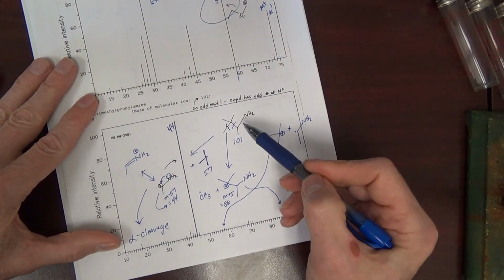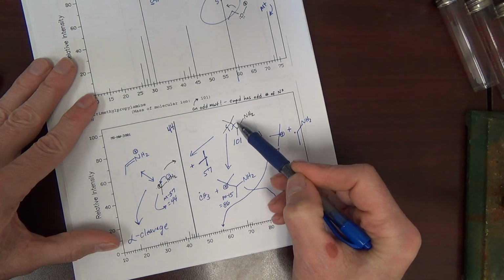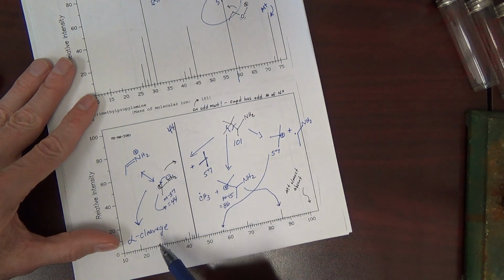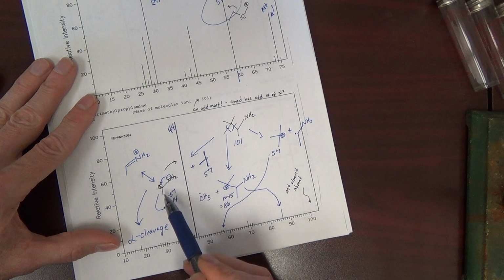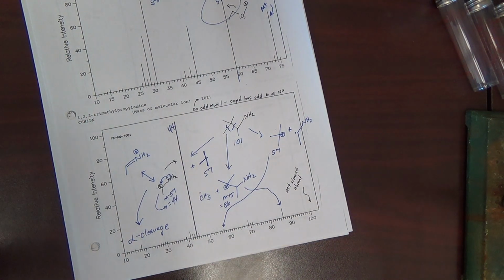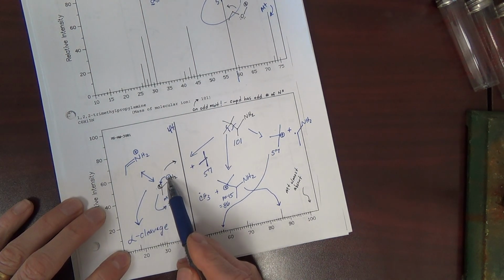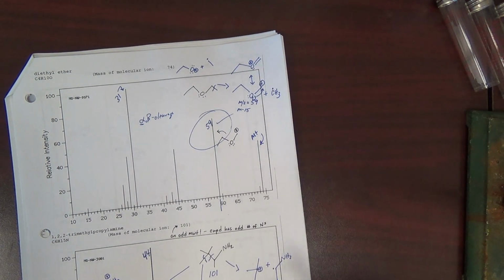Down here, here's their functional group. The first carbon's alpha, the next one's beta. We cleaved here to give this cation. That's an example of alpha cleavage because cleaving there gives a resonance stabilized cation. I will more commonly say alpha cleavage is where you cleave to make a cation next to a lone pair, because that makes it resonance stabilized.